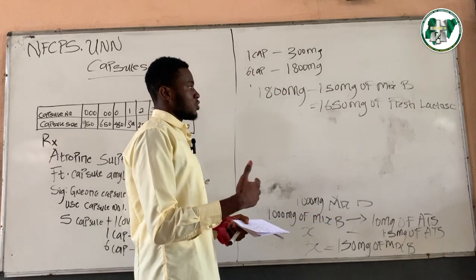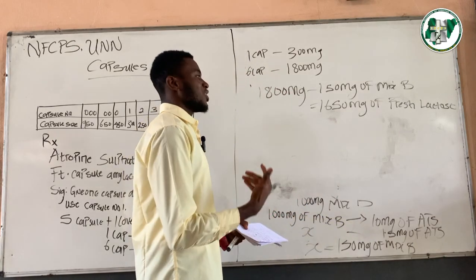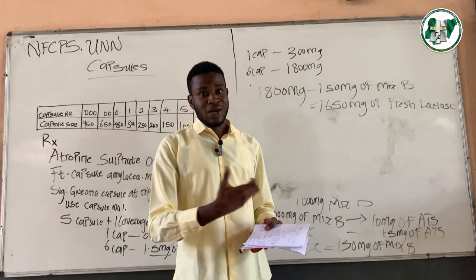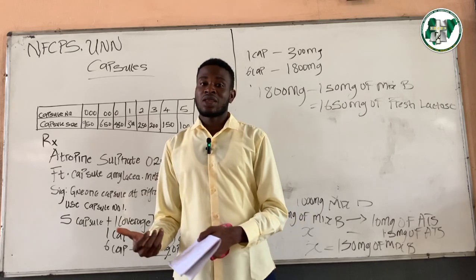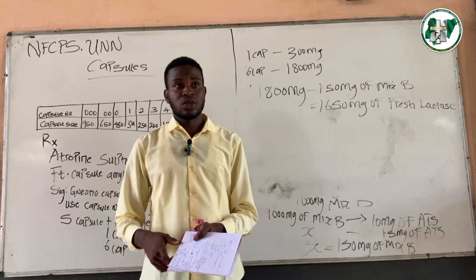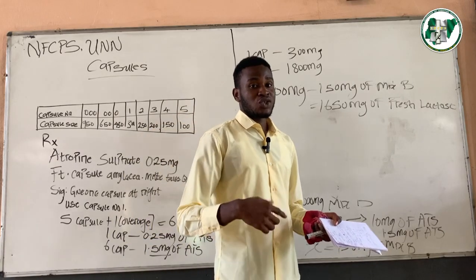So you note that you triturated it to a homogeneous mixture, mixture A. You now take 100 milligram of mixture A and weigh it out into a fresh mortar, and 900 milligram of fresh lactose is also weighed into the new mortar and triturated until a homogeneous mixture is formed.